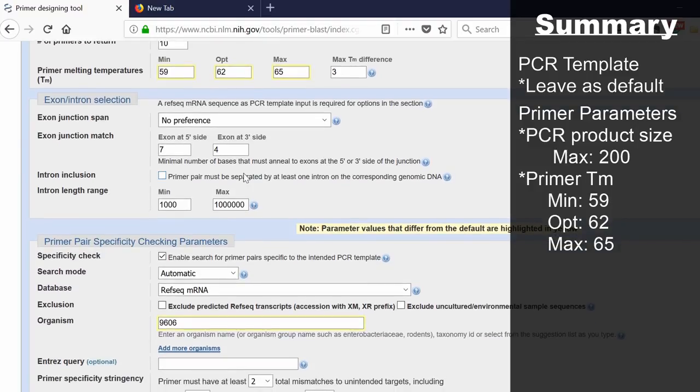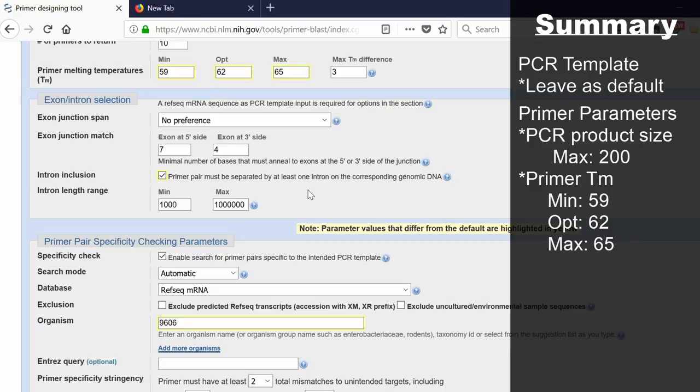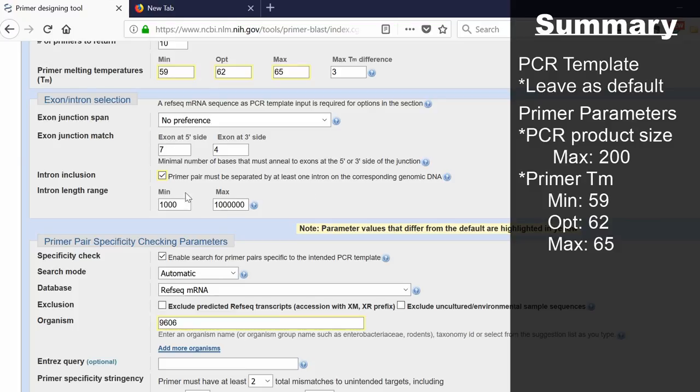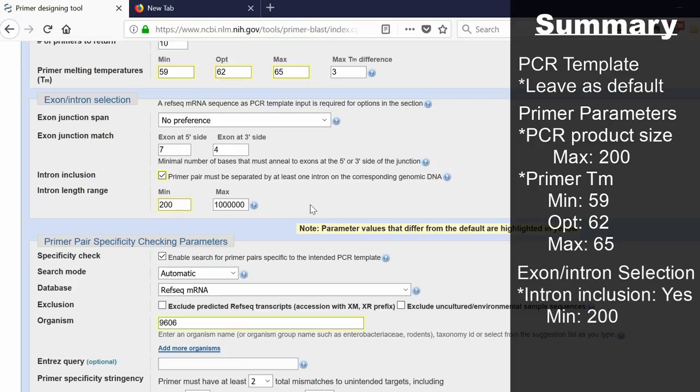What I do, however, is to specify an intron inclusion. I tick this option. What this is doing is saying I want one of my primers to bind on one exon and another primer to bind on a different exon. Therefore, it is separated by at least one intron. By doing this, it will limit the chance of genomic DNA amplification because introns are usually very big. Underneath it's saying what do you want the intron length range in base pairs to be. I'm going to put this down a little bit to 200 base pairs as the minimum, and then the maximum can be as big as you like.